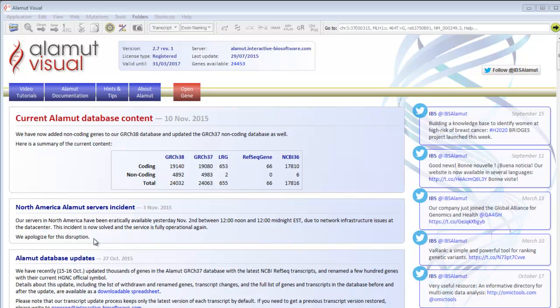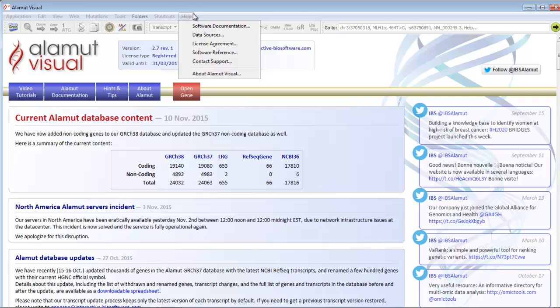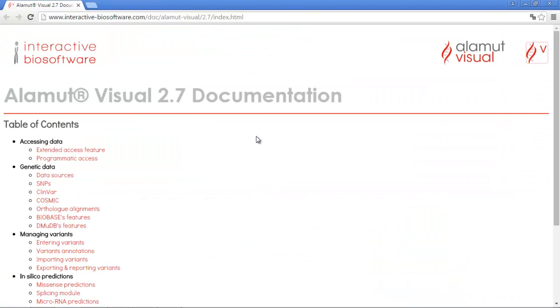In order to use Alamut Visual to its full potential, we strongly recommend you to read the documentation. To do this, go to the menu Help, Software Documentation. There you'll have access to the Alamut Visual user manual.